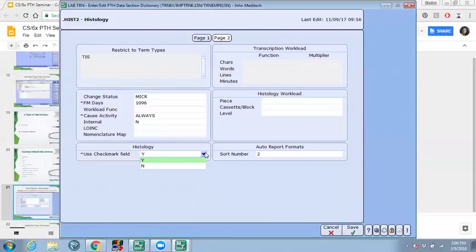I will be going over this at the end, so you guys could have an idea how it works. But basically, if you have 4 blocks created for a pathology tissue, you would need to mark all of these blocks as completed before you can go to the next level. If you mark only one of them as completed, then only that one will be available for the next step. Otherwise, if you want the system to allow the users to continue through the histology processing, you will set this prompt to no.